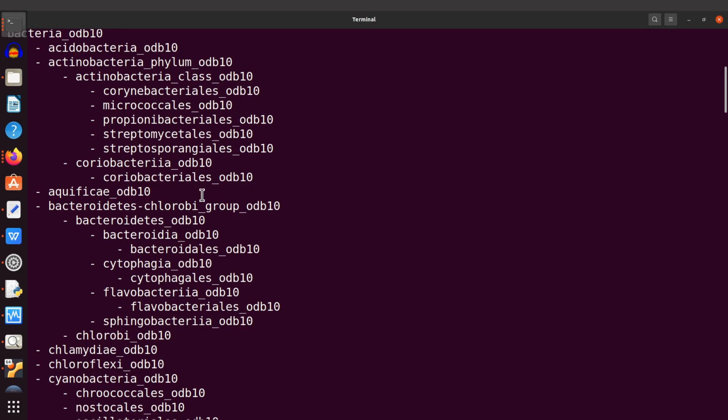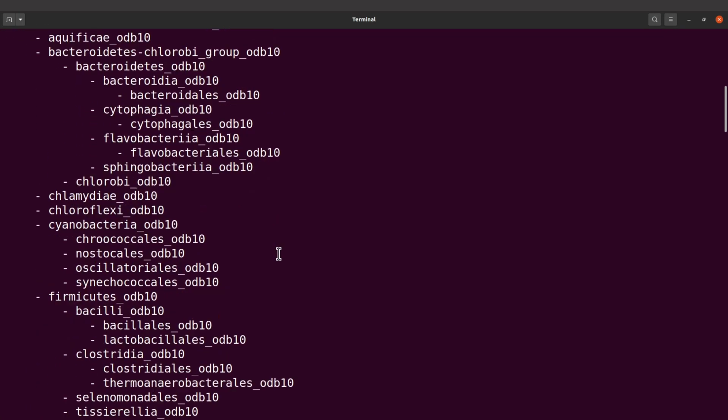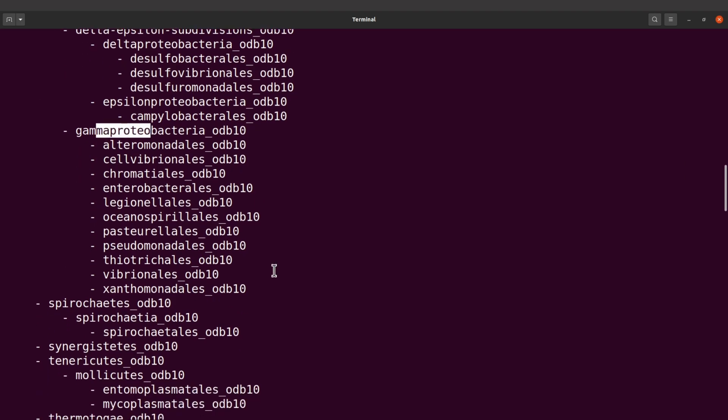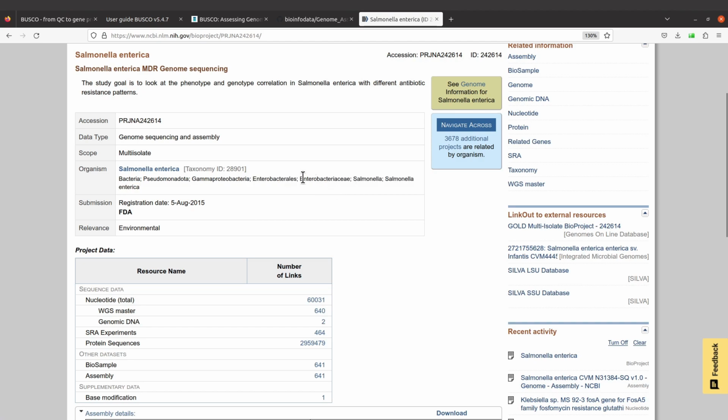So we can check them here. I've already done the test, so I'll scroll down to where the information is. When we are here, you select this one here. This is what I'm going to use. This is more specific. Okay, this one here, everything here. Yeah, that's what we have here.